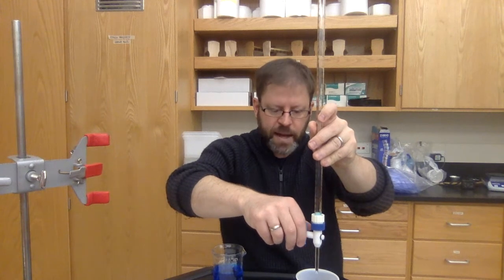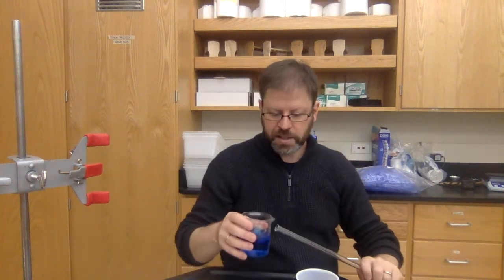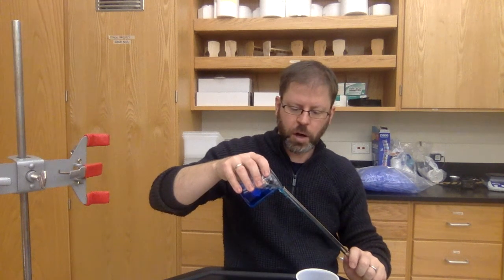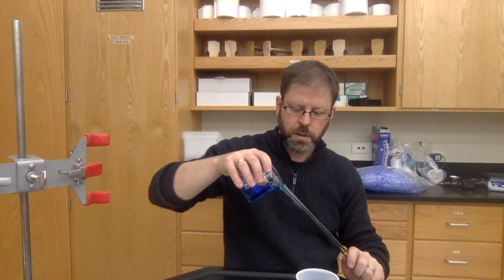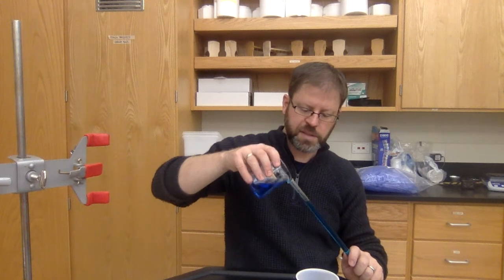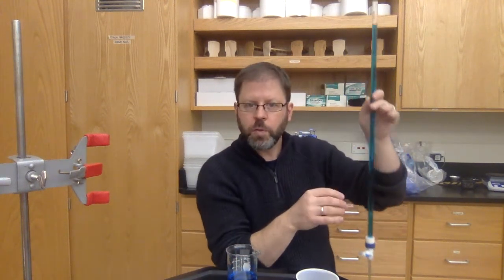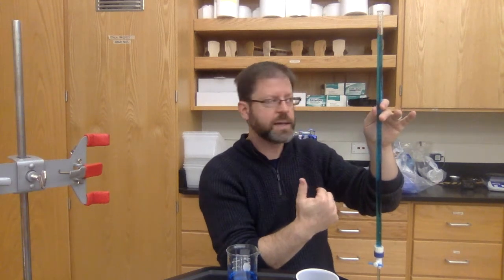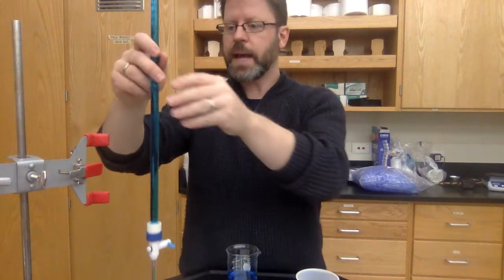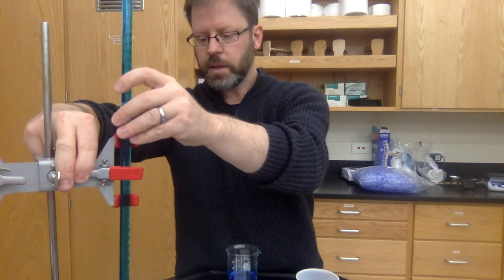All right, so now that is done, now I am ready to actually fill this. And so I'm going to come in here. You should always fill just below the top. Okay, don't try to hit it squarely. I'm like 0.3 or 0.4 milliliters lower than the top. I got kind of lucky that I hit it pretty well. Don't try to hit it exactly. Just take the measurement of what your start point is. Then you're going to clamp it in here. Okay.